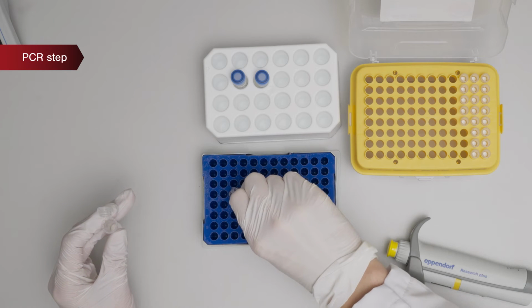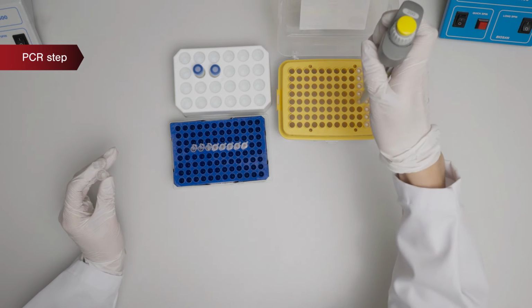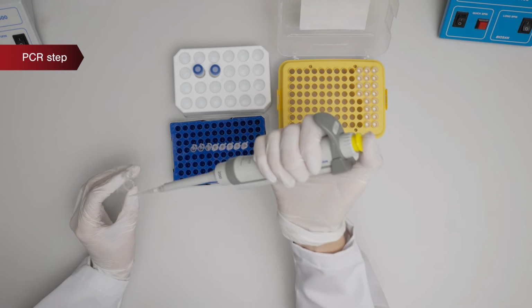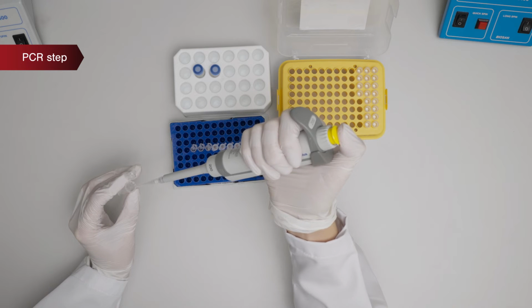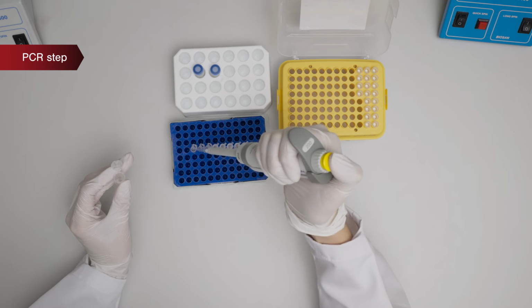To these 19 microliters of each sample, 31 microliters of the PCR reaction mix is added. Samples are vortexed 3 times for 3 seconds each time, then centrifuged, and the PCR reaction is set in the following conditions.